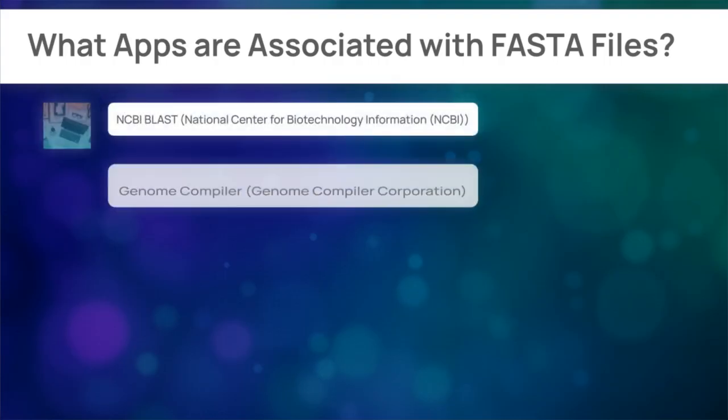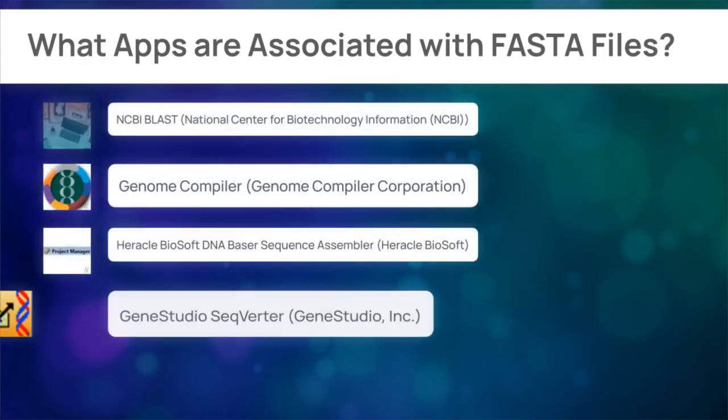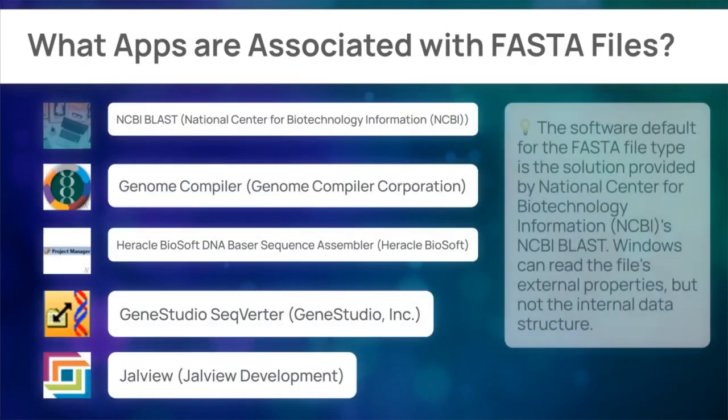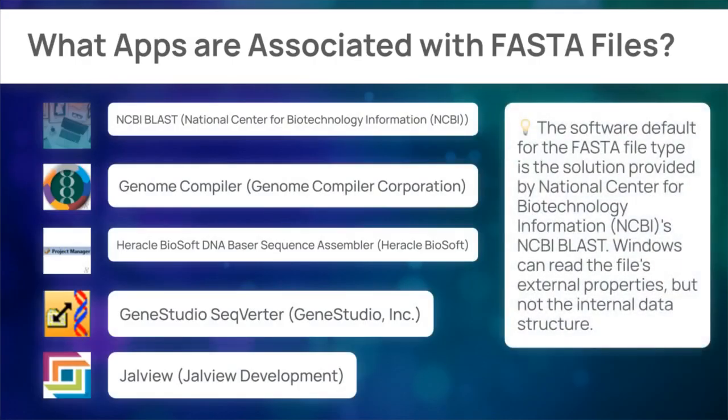National Center for Biotechnology Information, NCBI, maintains the integrity of the FASTA specification through NCBI BLAST. The system can open the file as plain text, but cannot apply its intended visual formatting. Windows may identify the file, but understanding its content requires the program that uses the data.